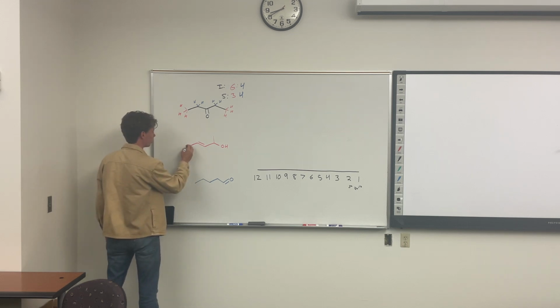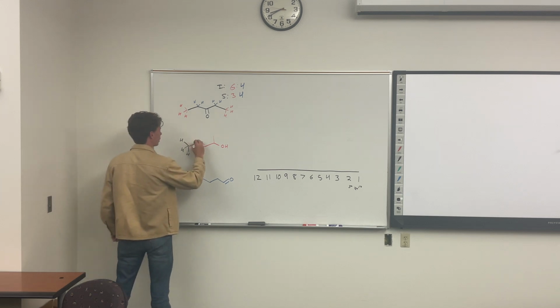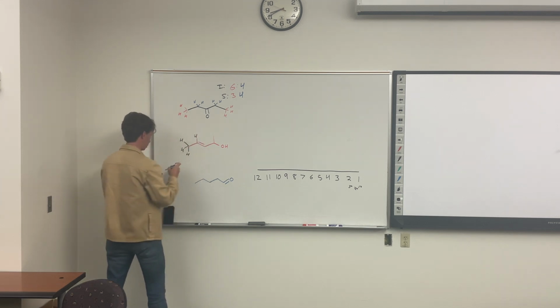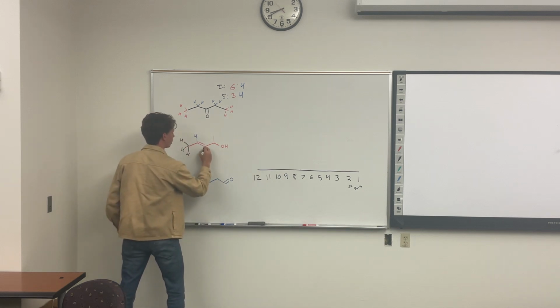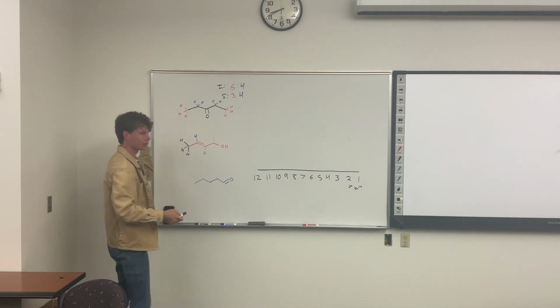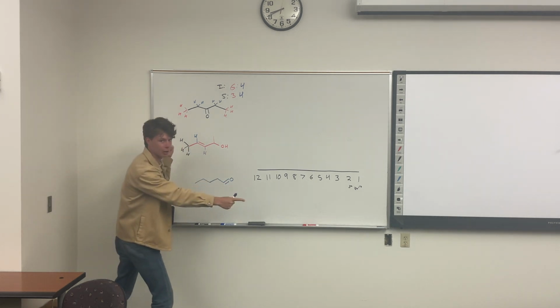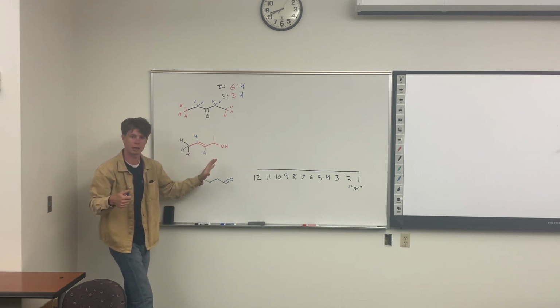We'll first start with a methyl group all the way over here. 3 hydrogens there. I have one on my alkene here, and one on my alkene over here. Okay, these are both alkene hydrogens. Why are they different? It's because this side of our alkene is different than that side of our alkene. That's going to make the chemical environment of these hydrogens different.